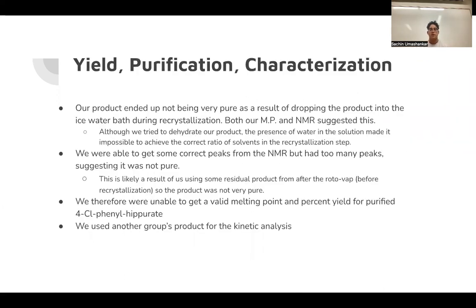Okay, so next we have yield, purification, and characterization. We actually ended up dropping our product into the ice bath during our recrystallization step. This obviously affected our melting point and NMR, which we will discuss in a second. We tried to dehydrate the product, but this is kind of impossible since there's water in the solution. So it was very difficult to find the right ratio of solvents in that step.